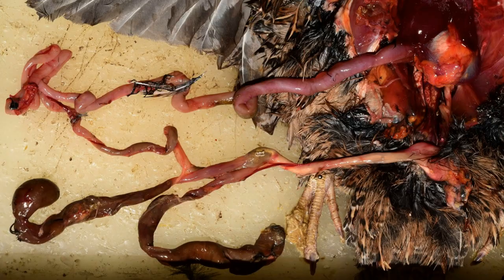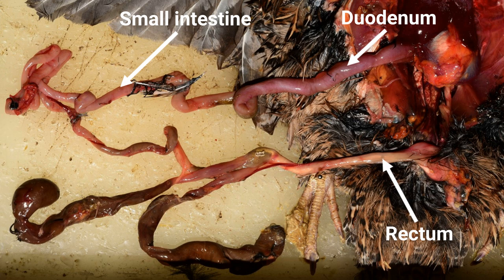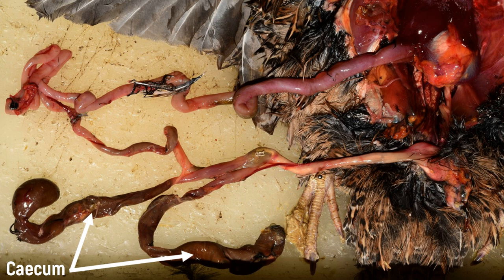When the individual organs are exposed, the individual parts of the digestive system, especially the intestine, can be easily recognized. At the transition from the small intestine to the rectum, there are two ceca. These can be very long in ducks and their allies, the anseriforms, and chickens and theirs, the galliforms.